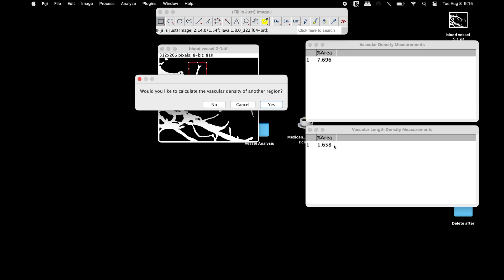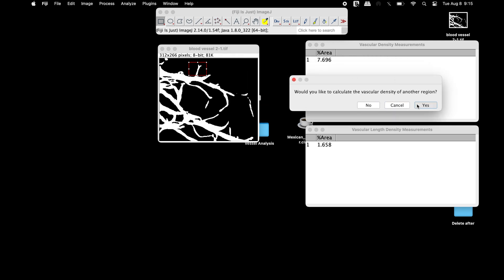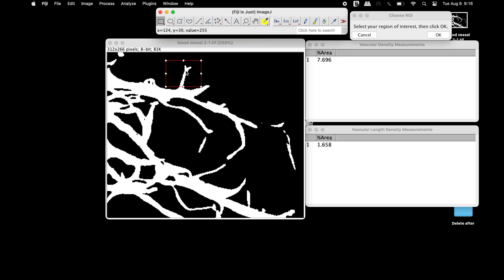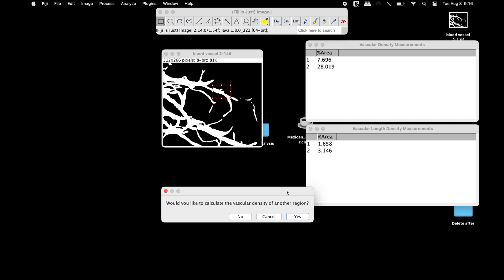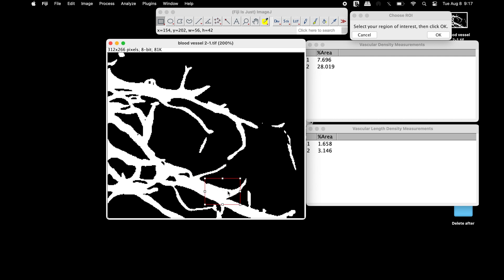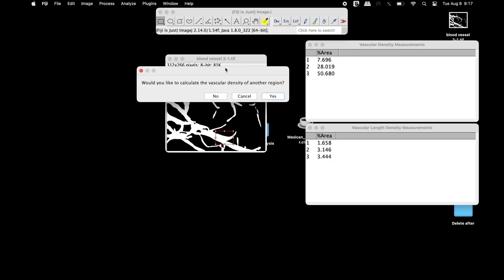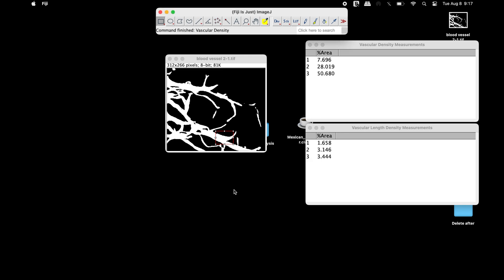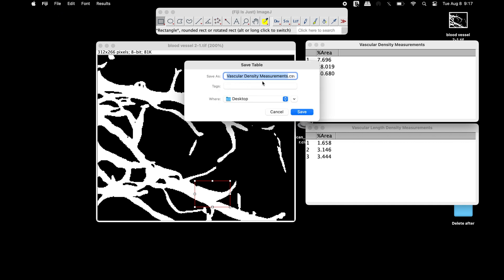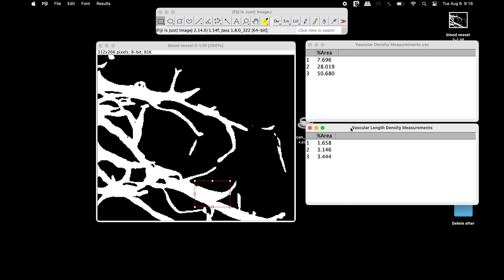The second result is the vascular length density, which measures the ratio of skeletonized vascular area to total area. To measure more regions of interest, click Yes and select the region of interest. The results will be added to the existing results. To stop measuring, click No. To save the results, click File > Save As — results are stored as a .csv file.